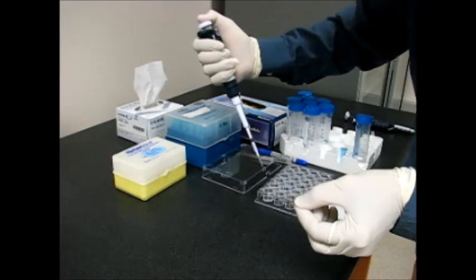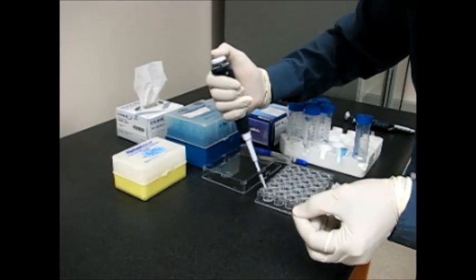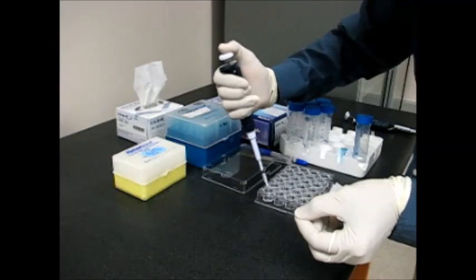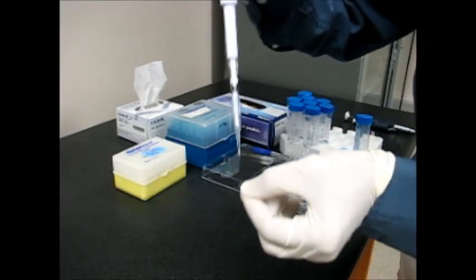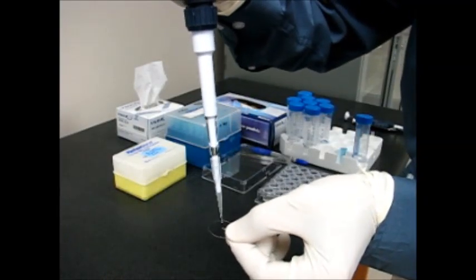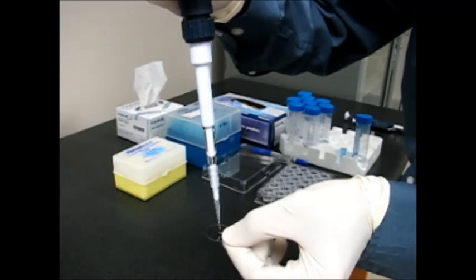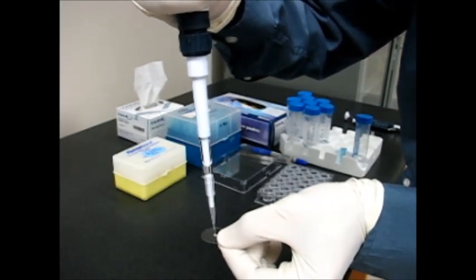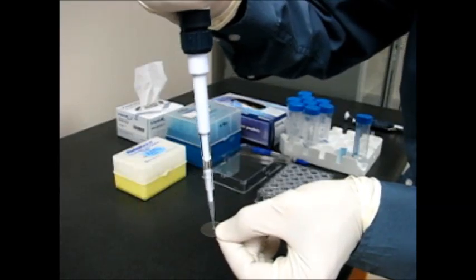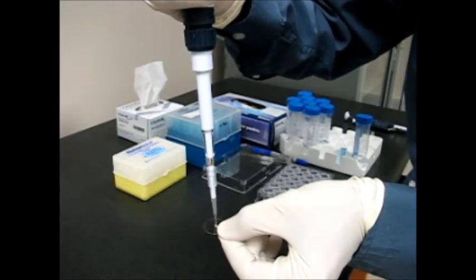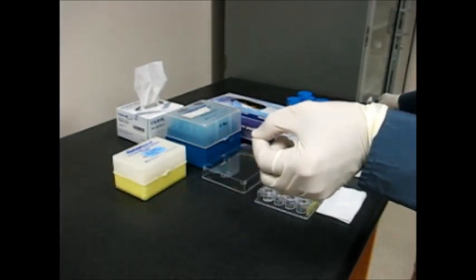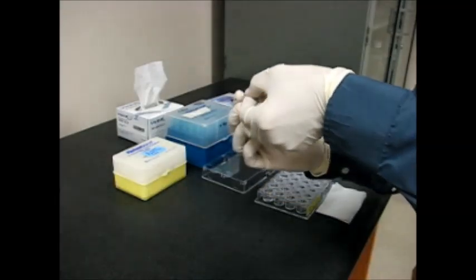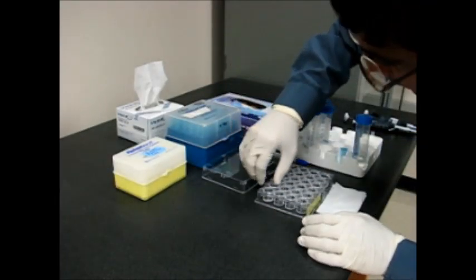I then pick up the precipitant solution from well A1 and add it on top of the protein solution and then gently mix it one, two, three, four times trying to avoid bubbles. Once it has been set up I simply flip the cover slip and put it on top.